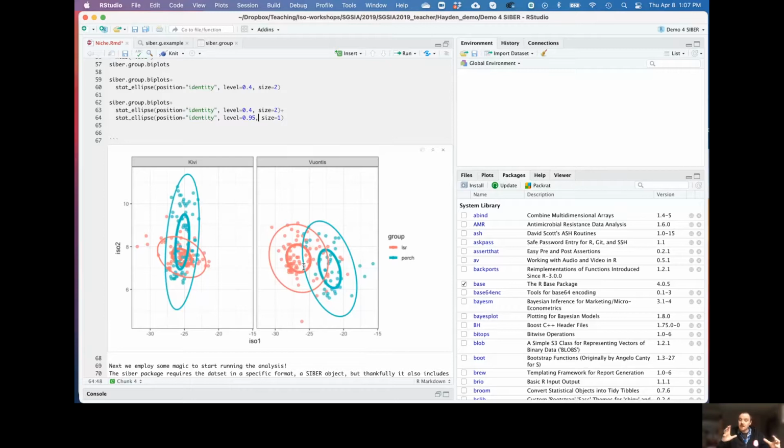The bigger you make it, the greater the proportion of overlap is going to be. So if you're presenting these data, make sure that you state the size of the ellipse, or what the characteristics of your ellipse are. And if you're reading somebody else's data, reviewing a paper or something like that, similarly, just keep an eye out for that. This is one of these things where what goes on underneath the hood determines the output, determines the results. So something to be aware of.